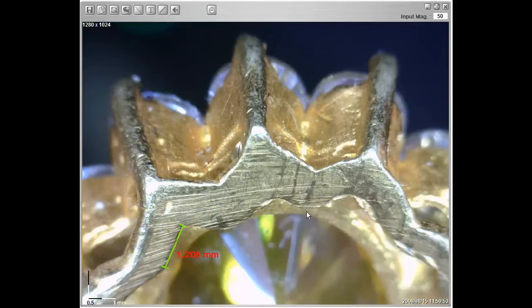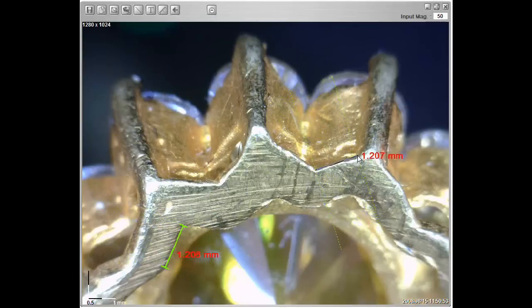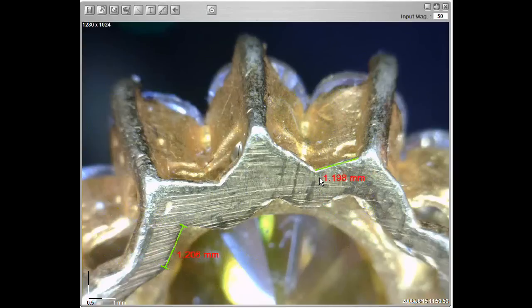Here is another example. Left click for the starting point, again for the ending point, and place the values where you like.